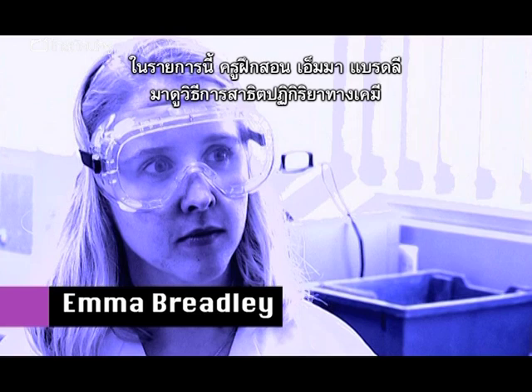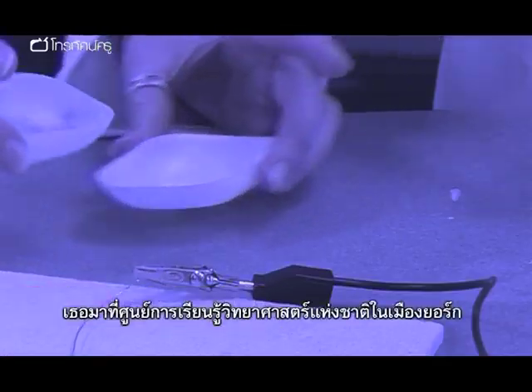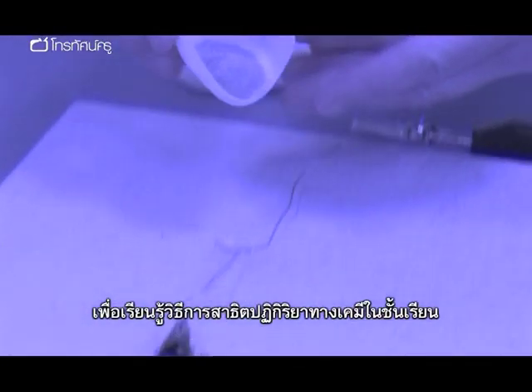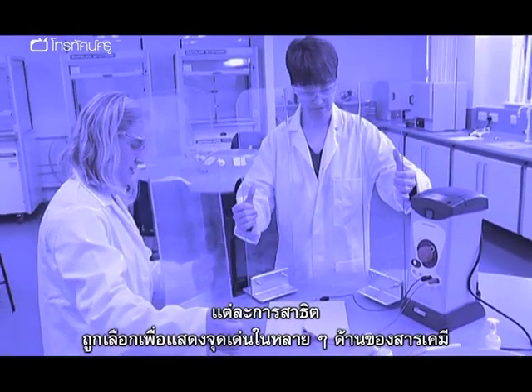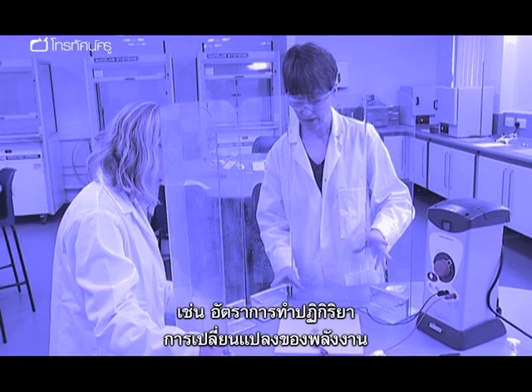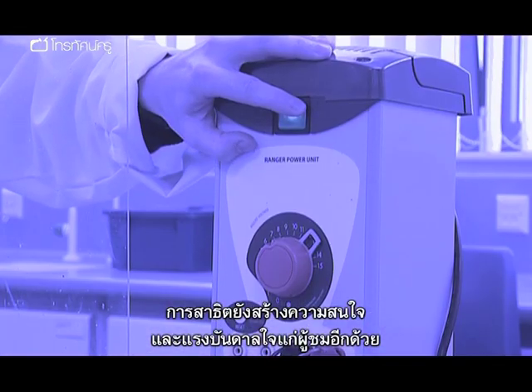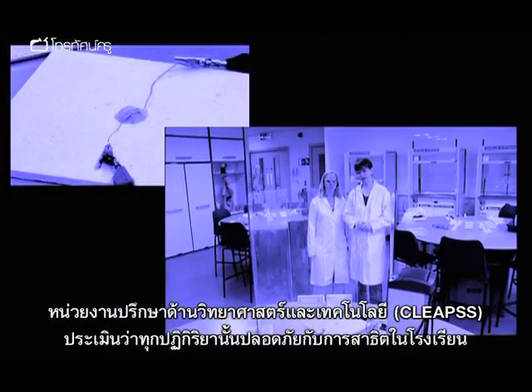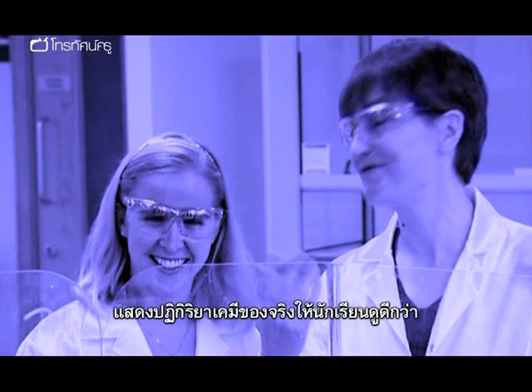In the following program, trainee teacher Emma Bradley has shown a series of chemistry reactions. Emma has come to the National Science Learning Centre in York to learn how to carry out these reactions in the classroom. The demonstrations have been chosen to highlight various aspects of chemistry, such as rates of reaction and energy changes, and they have all been selected to enthuse and inspire your audience. All the reactions have been assessed as safe to carry out in schools by CLEAPSS. So don't just show your pupils this video — get hands on and show them some real-life chemistry.